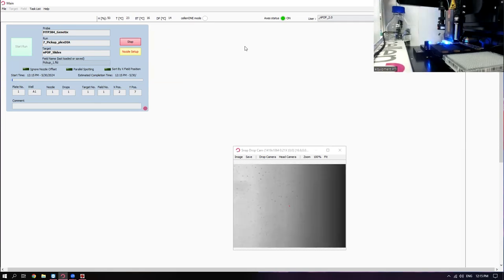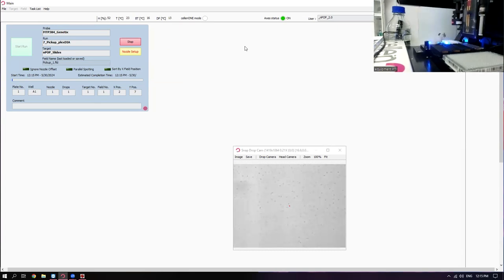And so I suppose we can take turns looking at this, because the pickup is pretty cool. Looking at rotate and everything, you see the 50% ACN and water mixed together, and then it was going to go into it, which got the place off the plate. So, it is pretty cool. Yeah, so we start off with aspirating, I think it's 5 or 6 microliters out of here. We then go and aspirate 12 microliters of the 50-50 ACN and water.